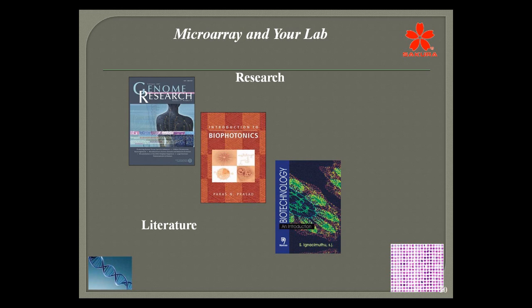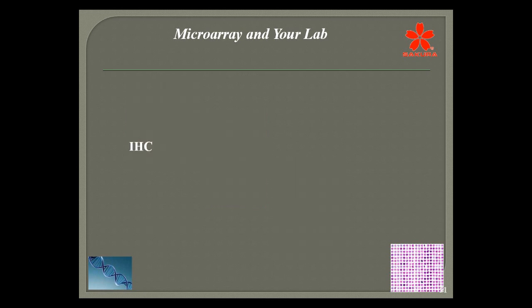So they're more than just tissue microarrays, but of course in histotechnology, tissue is our prime source. Literature is available, and journals contain a lot of good information. For example, I just saw one recently where someone made a melanoma tissue microarray. That helped them to study melanoma tumors from different time periods, or archived tissue, or the list could go on.